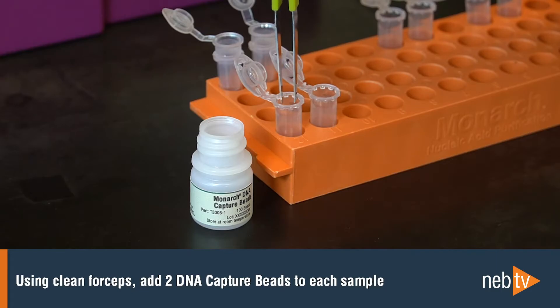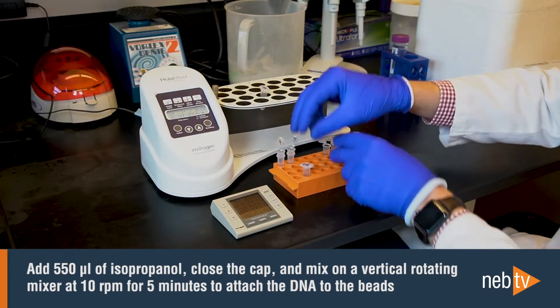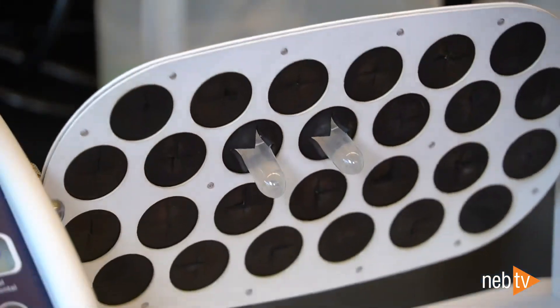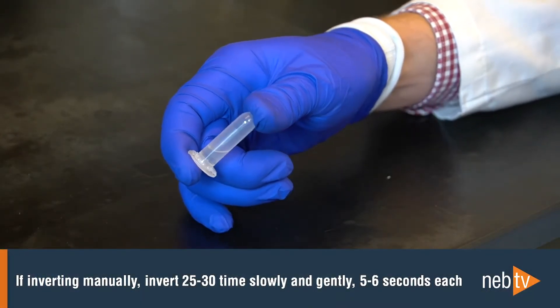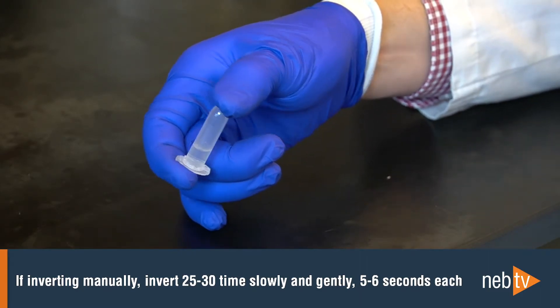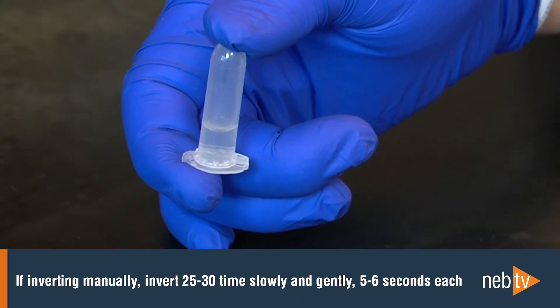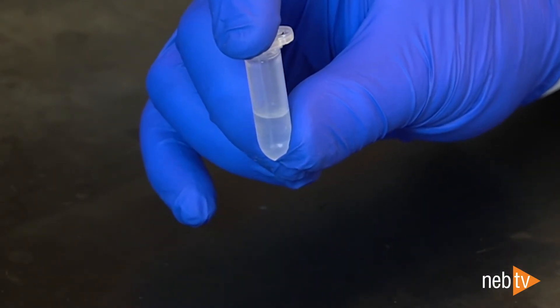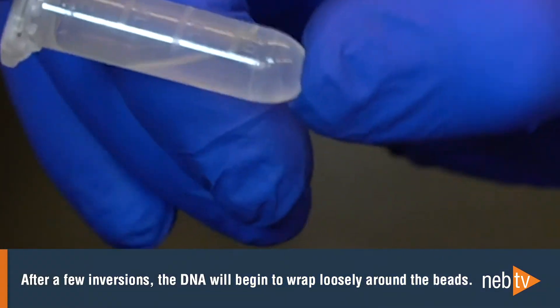Using clean forceps, add two DNA capture beads to each sample. Then add 550 µL of isopropanol, close the cap, and mix on a vertical rotating mixer at 10 RPM for 5 minutes to attach the DNA to the beads. If you don't have access to a vertical rotating mixer, you can invert the sample manually 25 to 30 times, slowly and gently. A manual inversion is complete when the tube returns to the upright position, and each inversion should take around 5 or 6 seconds. If you carry out the inversion slowly enough, no beads will stick to the bottom of the tube. After a few inversions, the solution becomes more viscous and the DNA will wrap loosely around the beads.